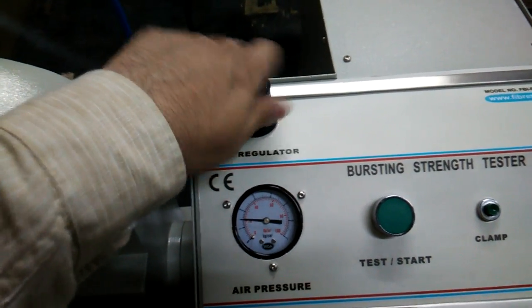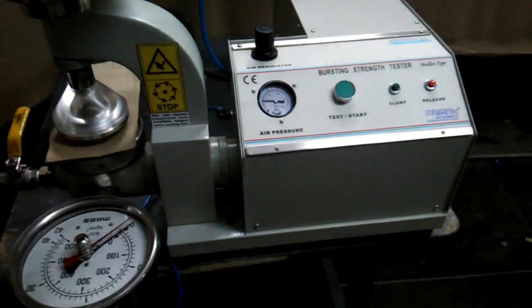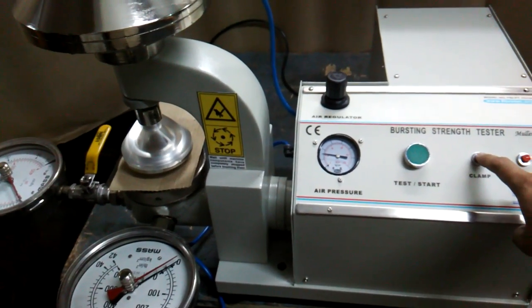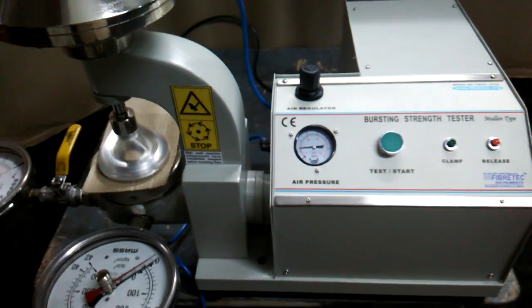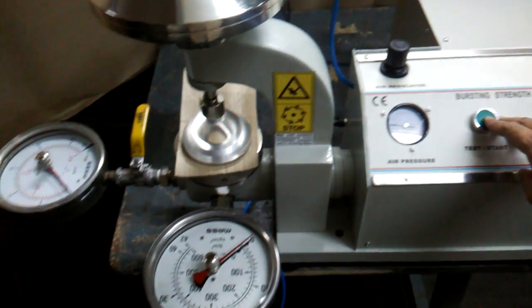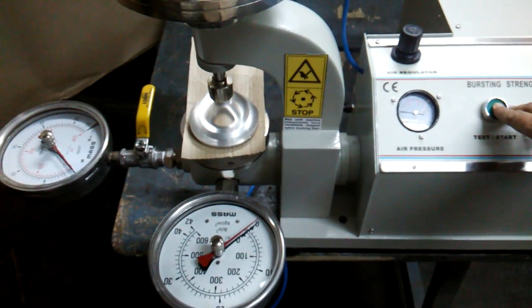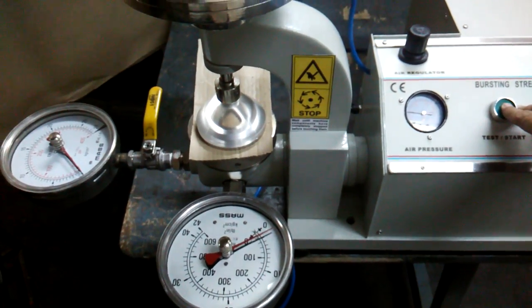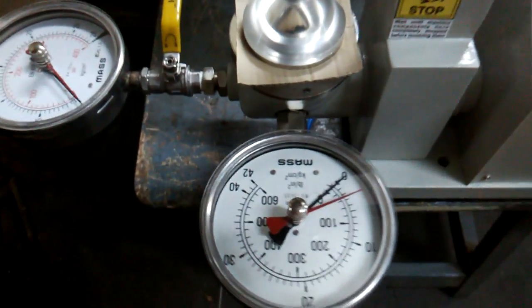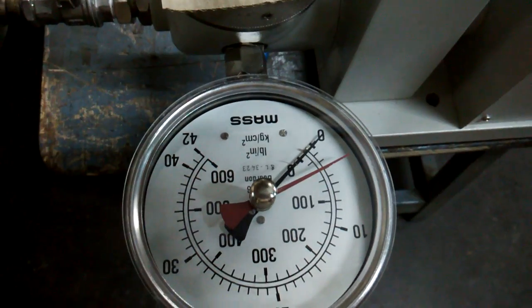You can increase and decrease the pressure like this. By pressing the start clamp, we can pneumatically clamp the specimen and then start pressing the test and start switch until the burst occurs.